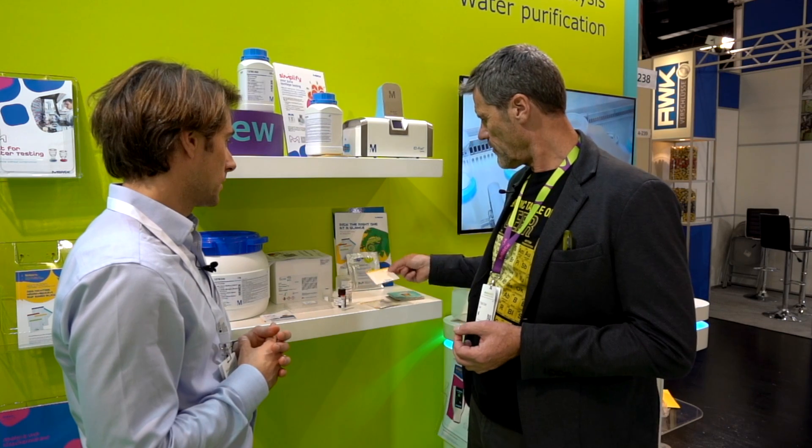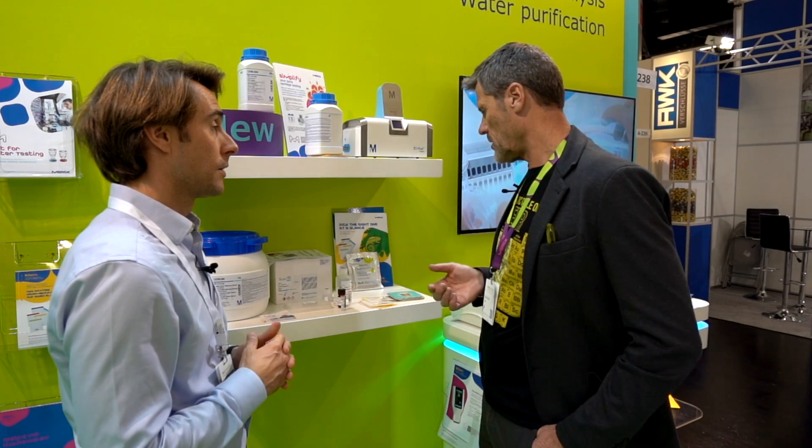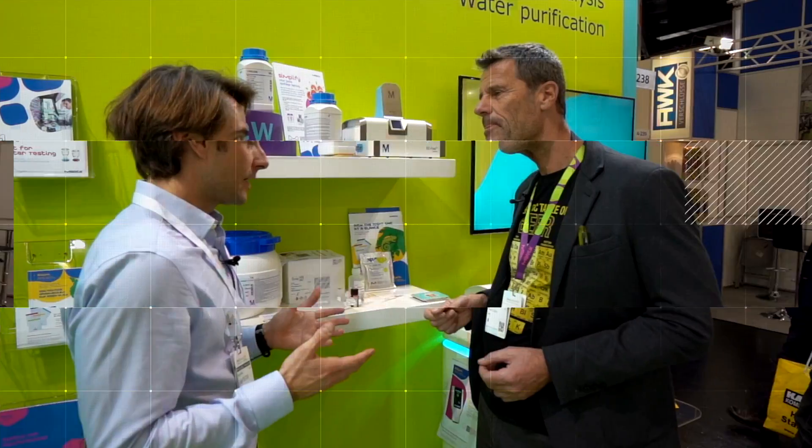It's more expensive than a normal agar, that's clear, but the advantage is the easy handling. We have very good experience with this product, and we hope to shortly get other kinds of germ groups to be analyzed. Thank you very much to Peter for this — if you have any questions for this product you can ask Peter directly, as he is in charge of other biomonitoring products. Do not hesitate — thank you and bye bye.